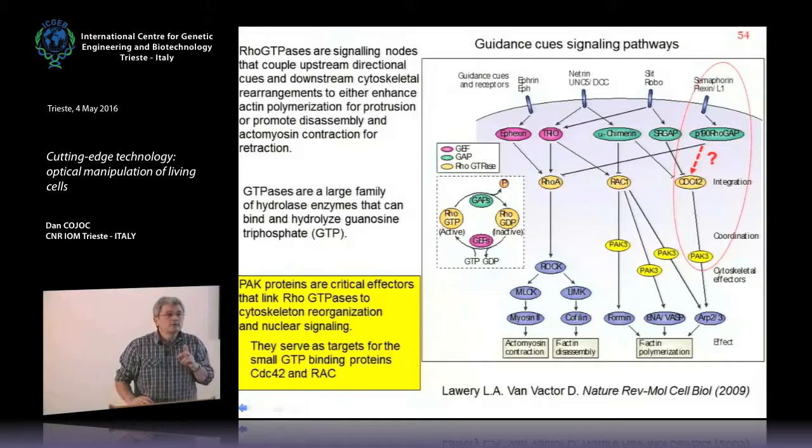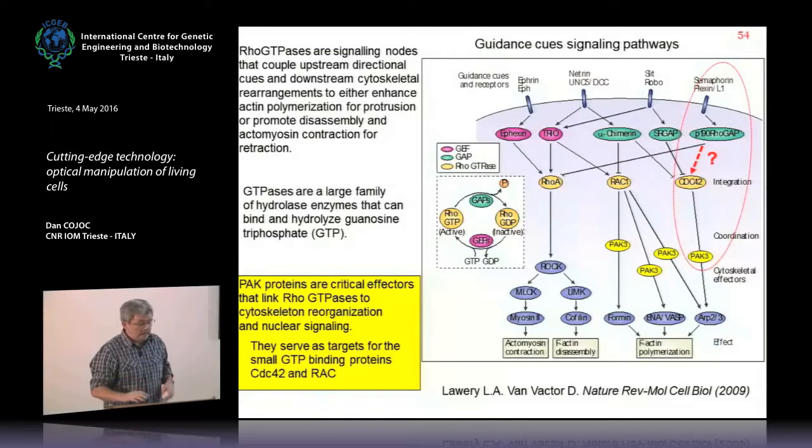Okay. Then by now we saw morphology and morphological effects, and we want to see a bit more in detail what happens. So for instance, what happens with the signaling pathways. In this project with SISSA, we want to see the activation of the GTPases RhoA and Cdc42 when we deliver semaphorin locally, because it is not known if they have a role or not in this pathway.